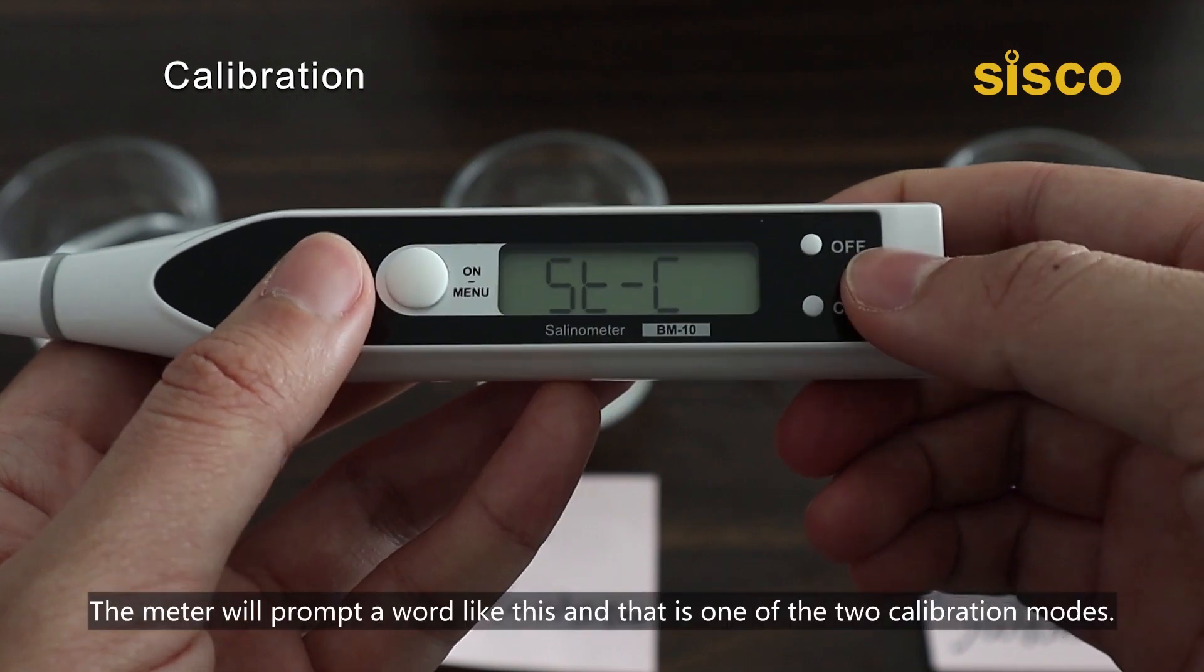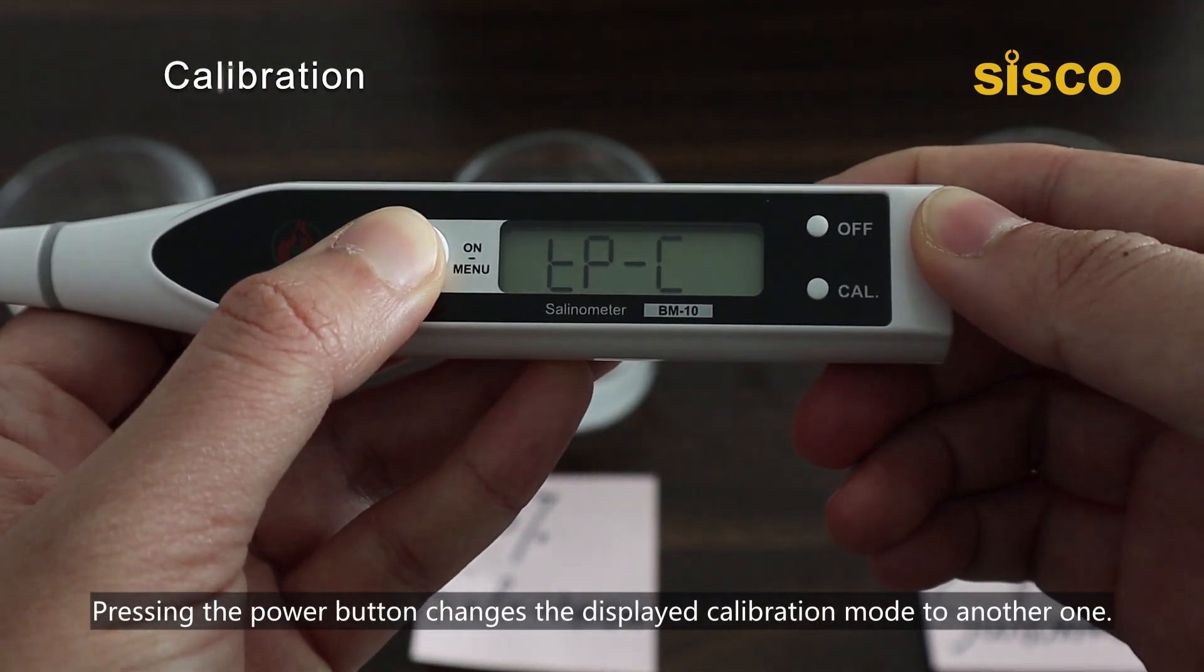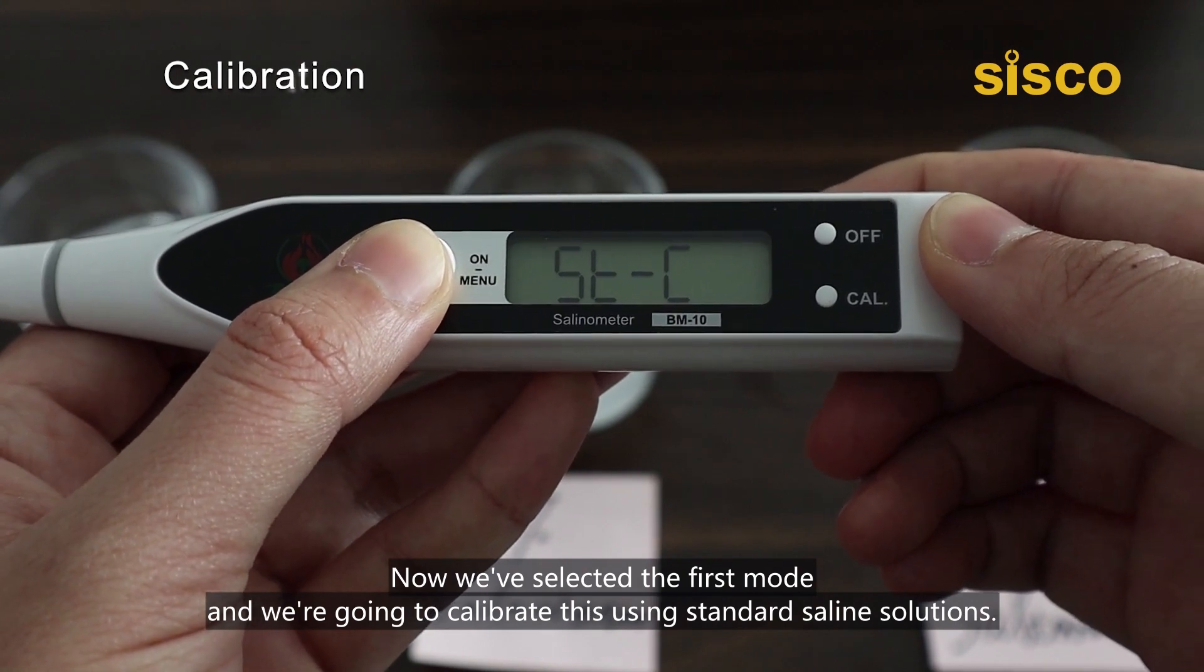and that is one of the two calibration modes. Pressing the power button changes the displayed calibration mode to another one. Now we've selected the first mode, and we're going to calibrate this using standard salt solutions.